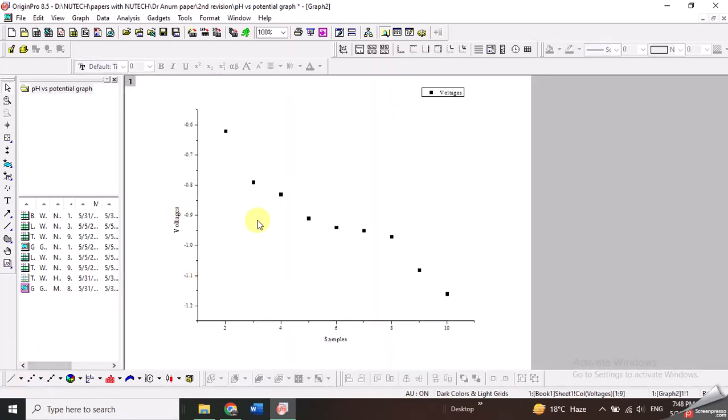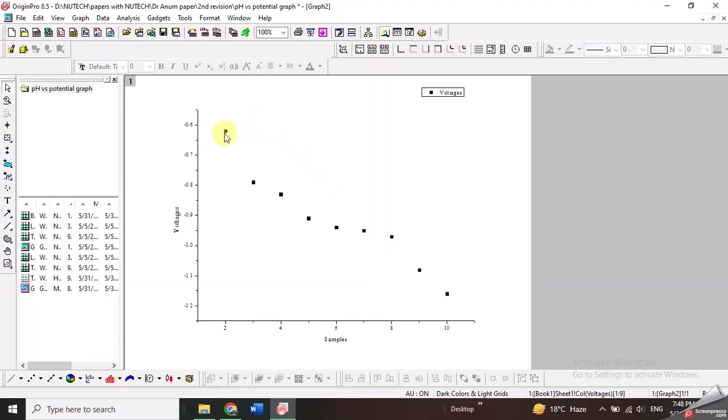Using the scatter option, you can see from the data that there is a straight line here and there is a straight line here, with a linear region in between. I want to linear fit this data separately in this region and separately in this region.